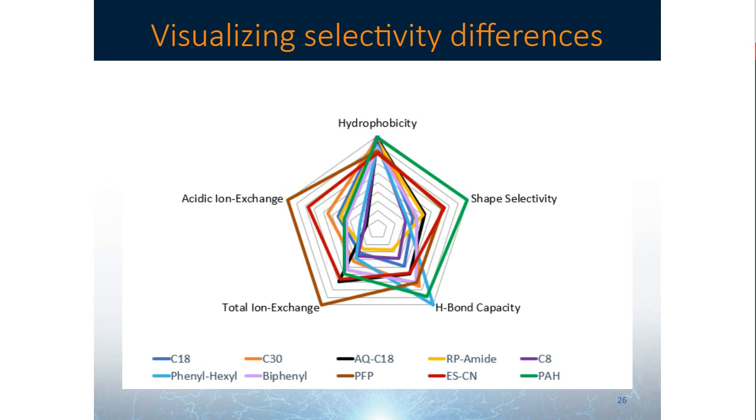Okay. Do you have any recommendations for mobile phase modifiers to assist peak shape? Sure. If you're using UV detection, like I mentioned earlier, I'd recommend trifluoroacetic acid, or TFA, for its ion pairing capability. And of course, this is running at low pH. If you're using mass spec detection, then I would suggest difluoroacetic acid or a mix of formic acid with ammonium formate for good peak shape. It's also possible to use mixes of TFA and formic acid for a compromise with good peak shape and ionization efficiency.